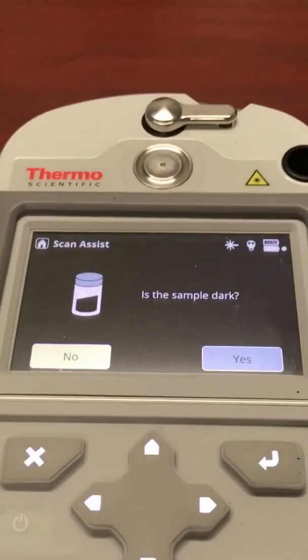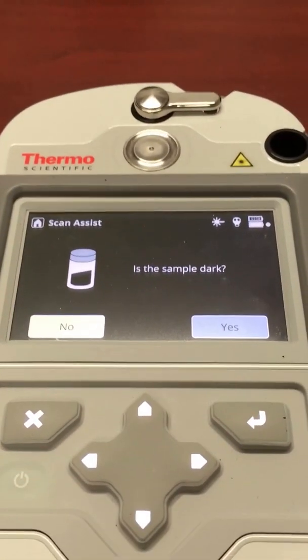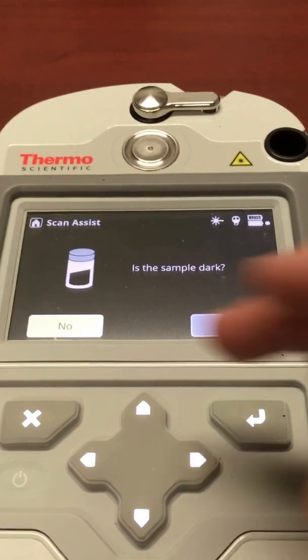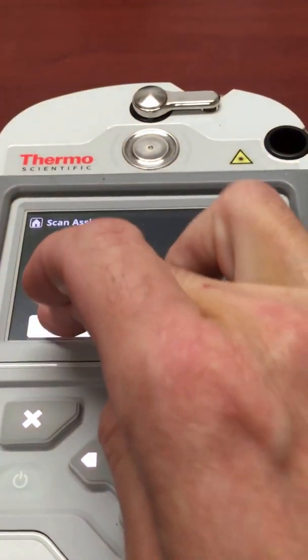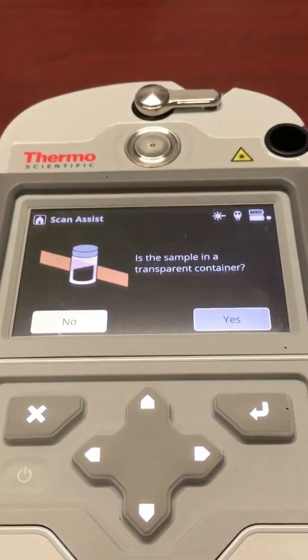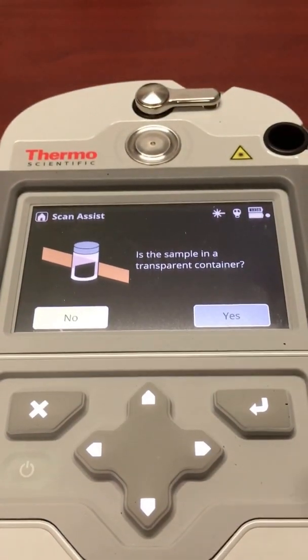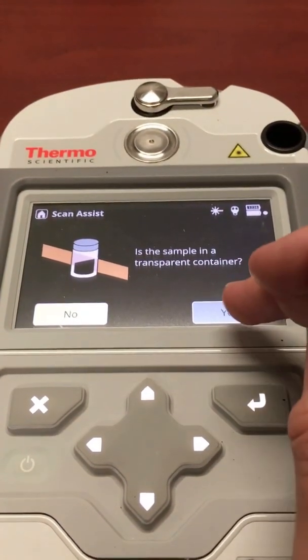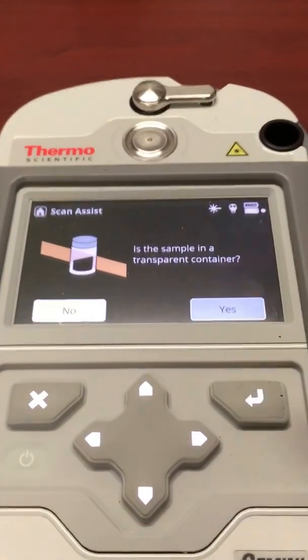The device first asks if the sample is dark or not — it's not. It then asks if the sample is in a transparent container — yes it is.